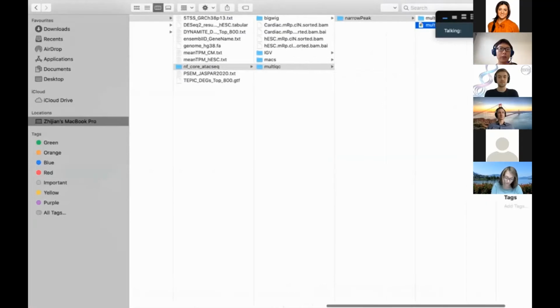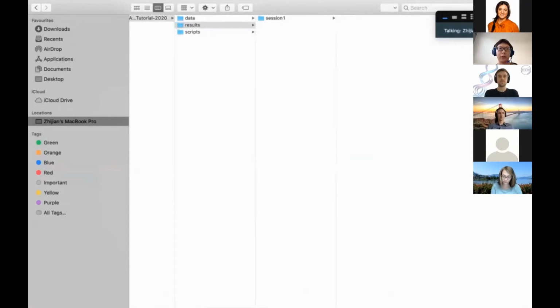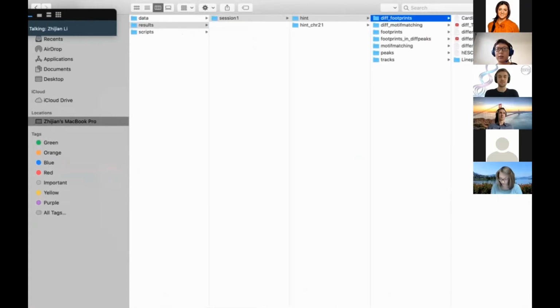I will just show you how the file looks. Go to results, session 1, hint, differential footprints. Click here.